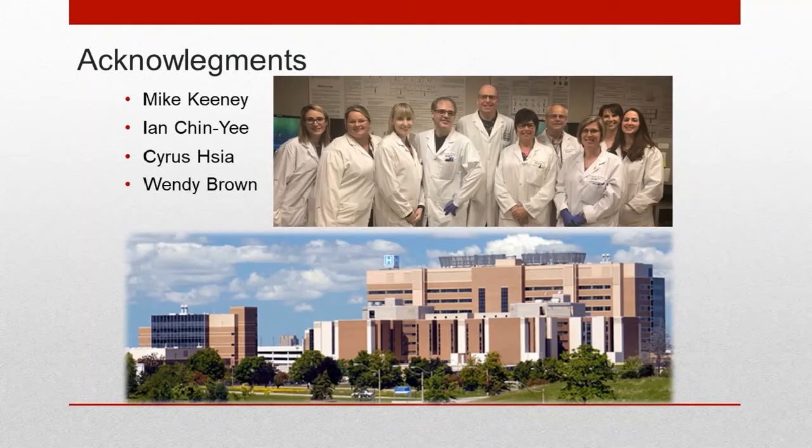Sure, Jeremy. The antibody combinations were developed actually quite a long time ago, and they were based on the Bethesda guidelines, the WHO originally 2008, but then revised with the 2016 guidelines and some other publications as well. They were done in consultation with a fair number of people.